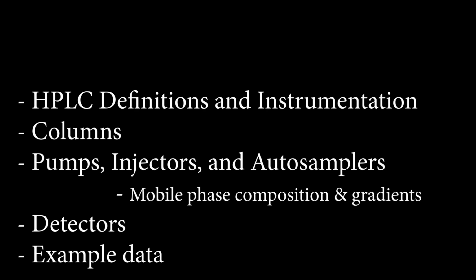Okay, so we've gone through definitions, instrumentation, we went through the column chemistry, particles and things, then we went through the nuts and bolts of the pumps, injectors, and auto samplers. Let's finish up with a discussion of detectors and look at some example data.